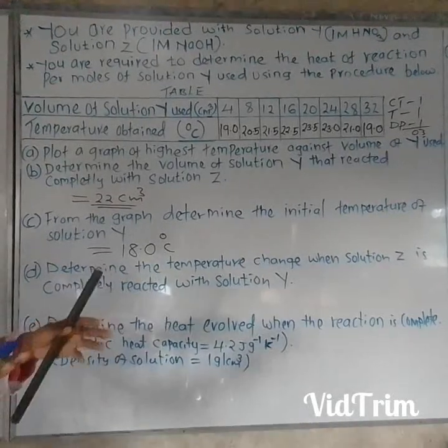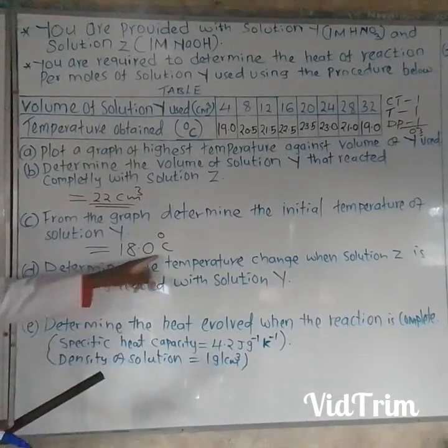We have done it. The initial temperature of solution Y is 18.0 degrees Celsius.